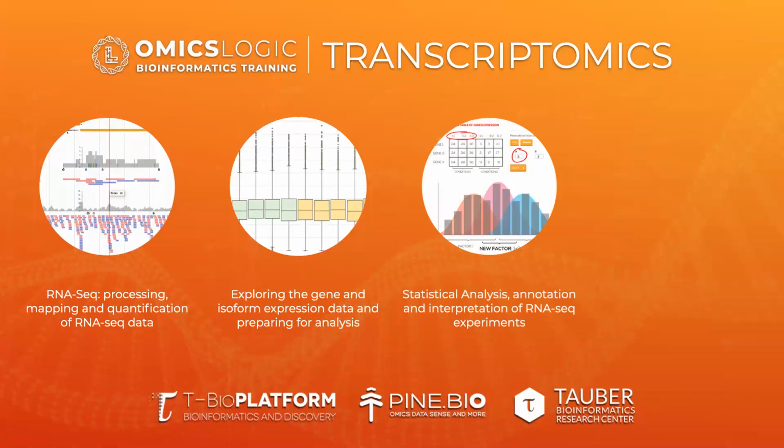We'll discuss some of the statistical approaches to analyze differences between conditions and identify statistically significant features of our data sets, how we can then look at what these features mean in terms of their biological activity, and how we can combine them into gene sets and pathways.